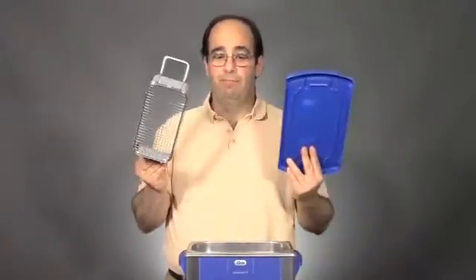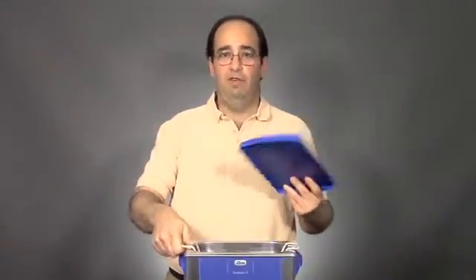The most basic accessories are the lid and the basket. The lid fits over the top of the unit and helps keep the unit quiet. It also slows down the evaporation of the heated liquid.